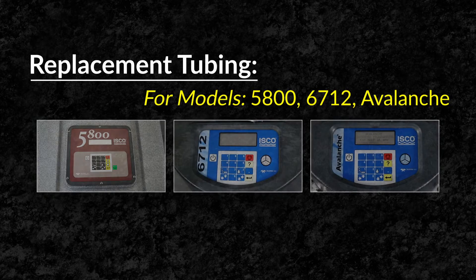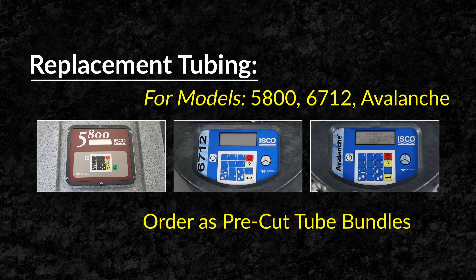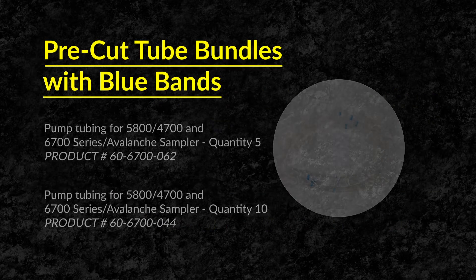Replacement tubing for models 5800, 6712, and Avalanche come in packages of pre-cut tube bundles.